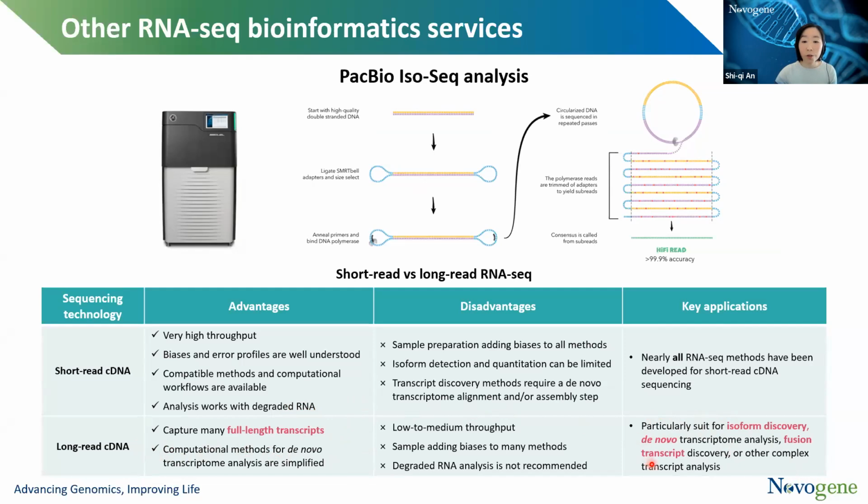However, this is not suitable for expression analysis. So if you want an expression analysis, you still require the shorter read-based sequencing. This is really for de novo and transcript characterization. If you want to know more information, please again watch our previous webinar on this topic.